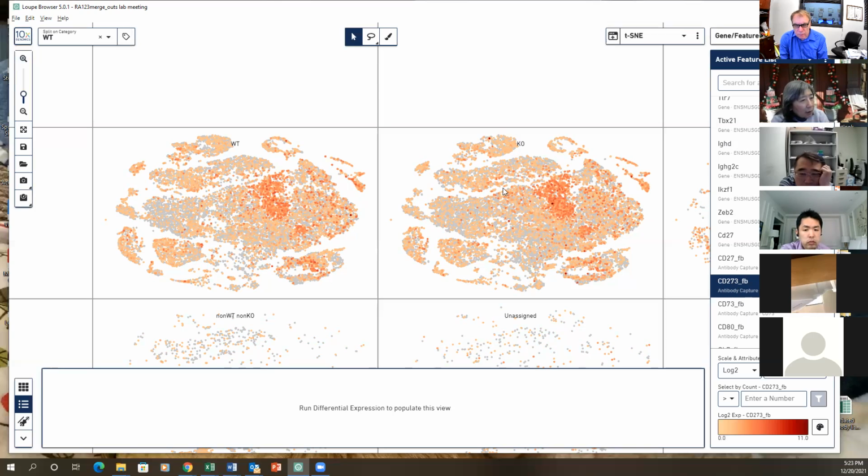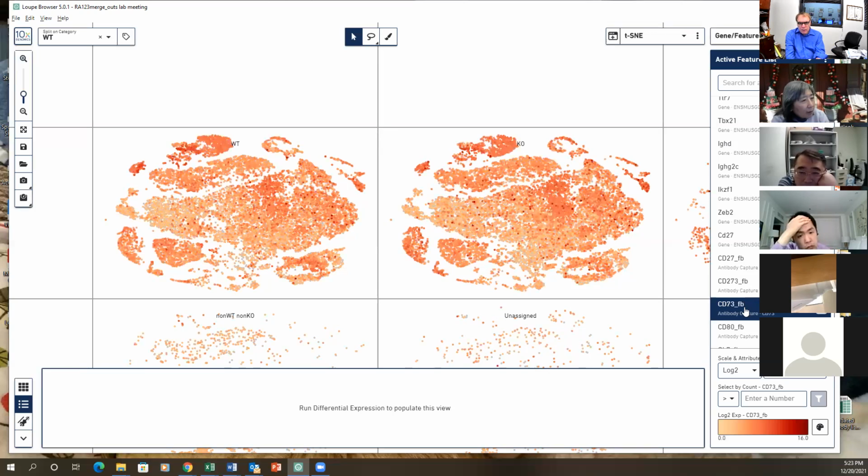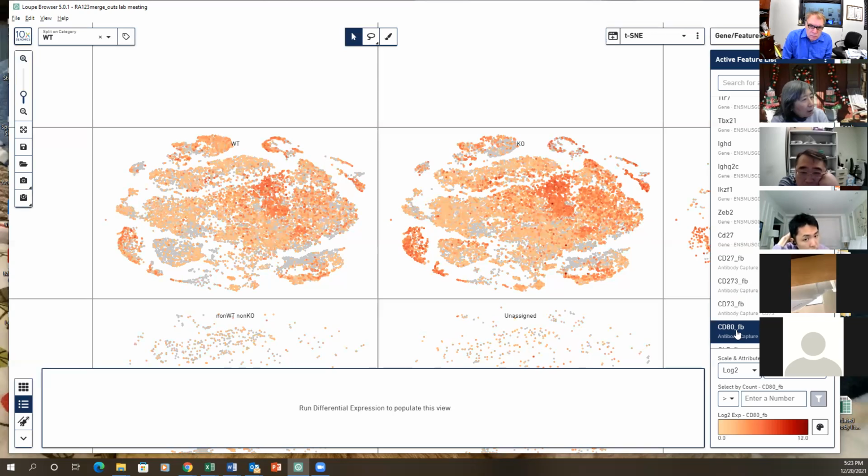So this is DN2 then. This 273 is the DN2 pathway of memory B cell development. This might be the germinal center pathway, right? Everything's germinal center on top. So 273, I think both have it. In a way this could be derived from both, but this is germinal center, and this is extrafollicular. 80 is the extrafollicular way.